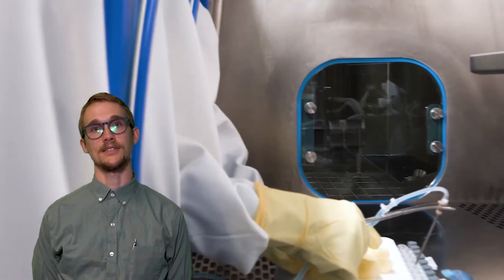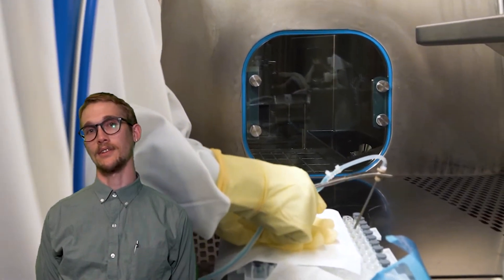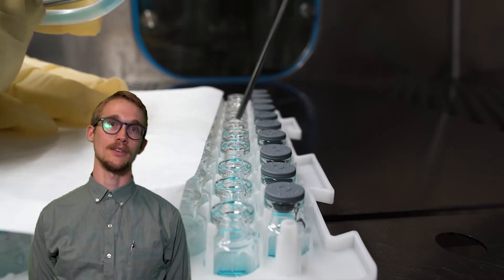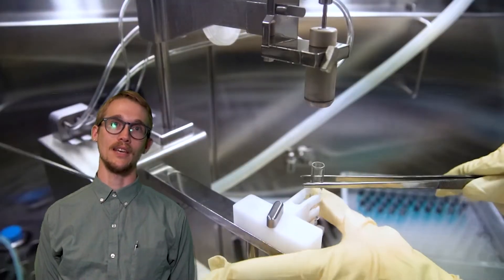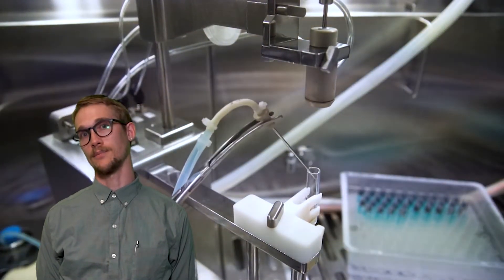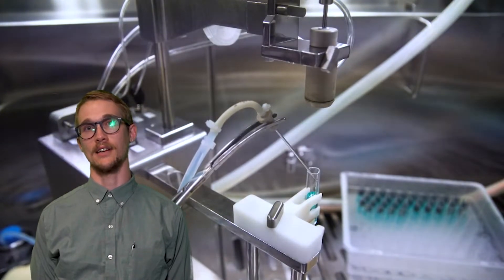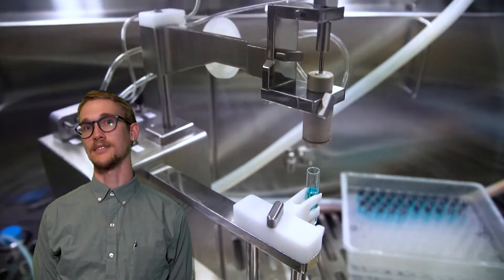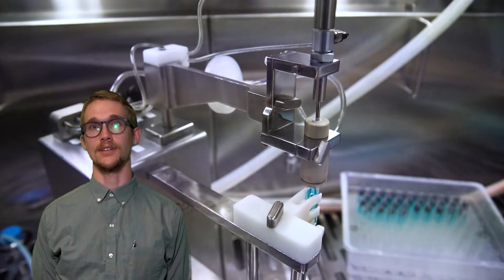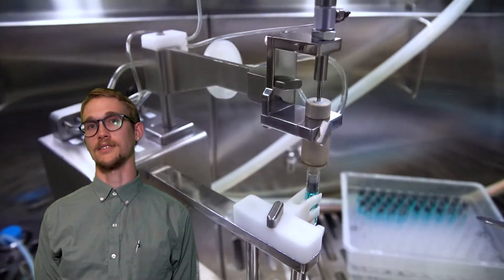My name is Rob Opschneck, and I am a manufacturing associate here at BSM. I have been on the BSM team for over three years now. Welcome to our manual filling line, also called the Germ3. This filling line is also isolator-based, but instead of using an automated filler, like you saw on our other line, we fill by hand in this filling line using the glove ports to access the area inside of the isolator. This is BSM's first filling line, and it began producing sterile drug products in early 2016.